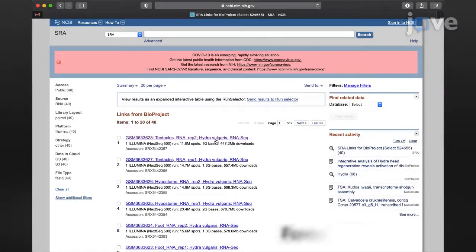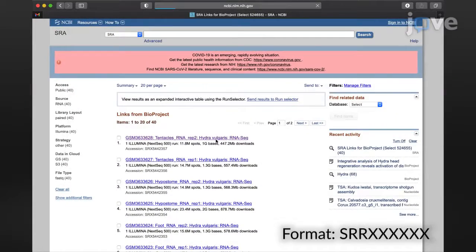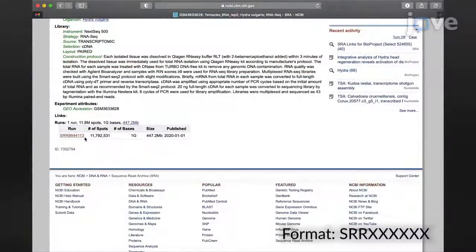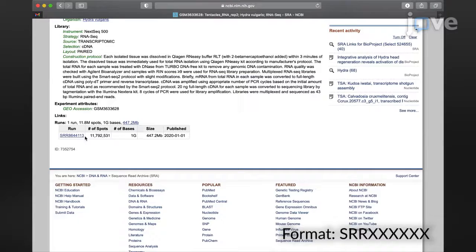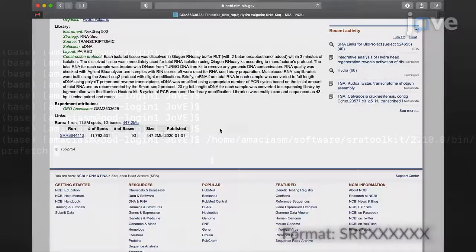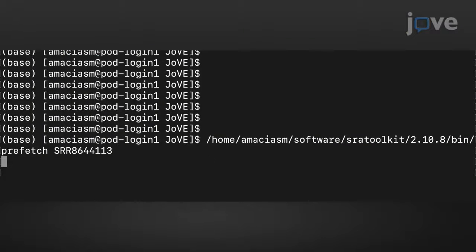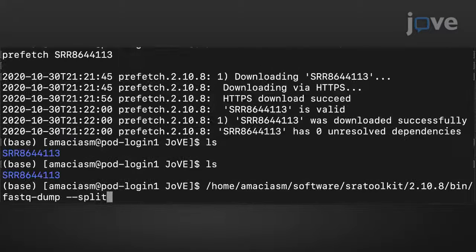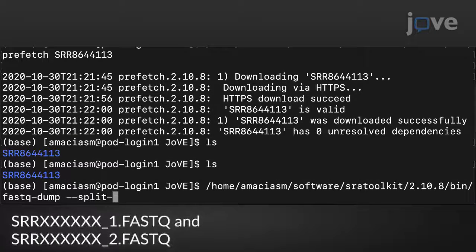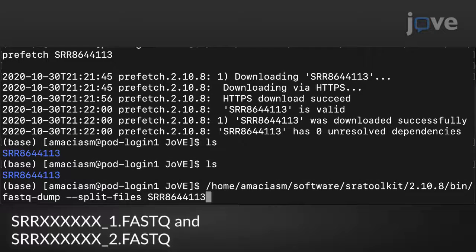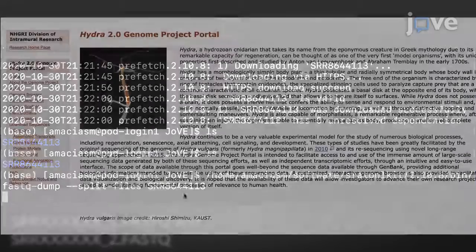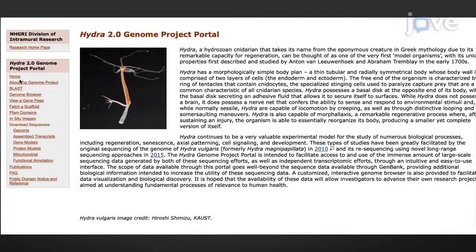Search NCBI for the SRA accession number for the desired samples. Then obtain the RNA sequence data in the terminal window. Find the reference genome online if one exists.